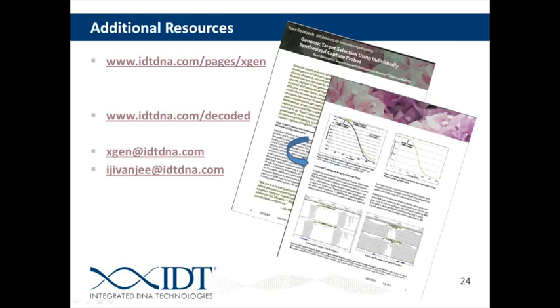However, with RNA-based technologies, the problems generally occur with high GC content regions. And so if you're trying to supplement an RNA capture, you shouldn't have a problem with the reagents that are supplied with that manufacturer. It's only when you have below 30% GC that you would need to reduce the stringency of your wash buffers.